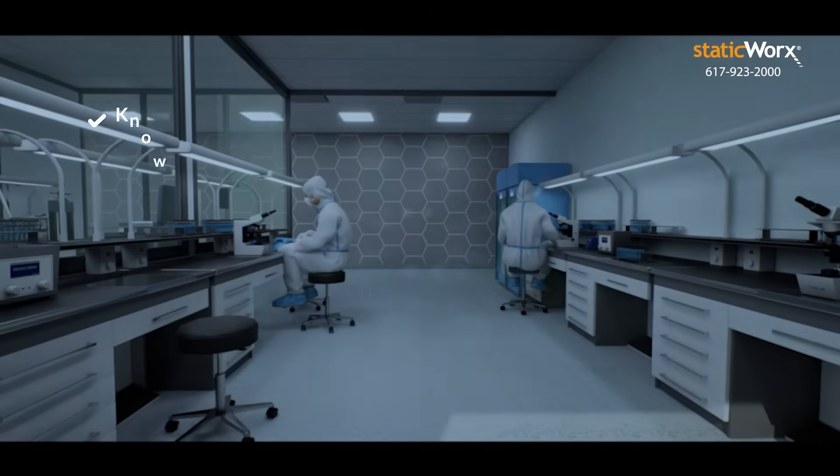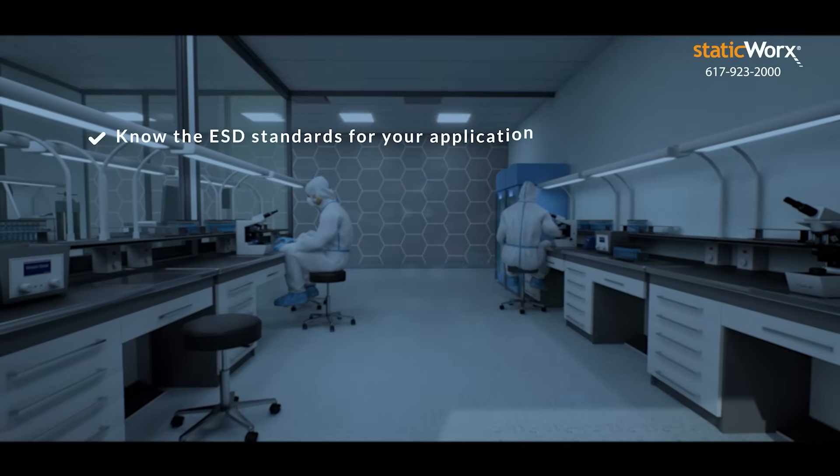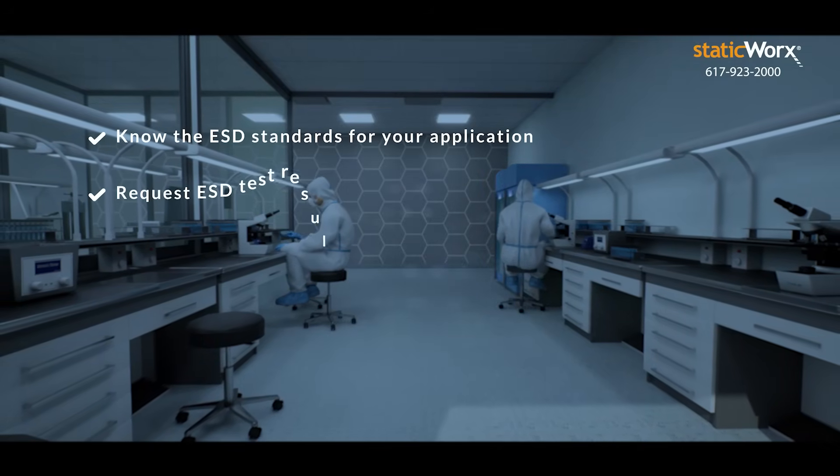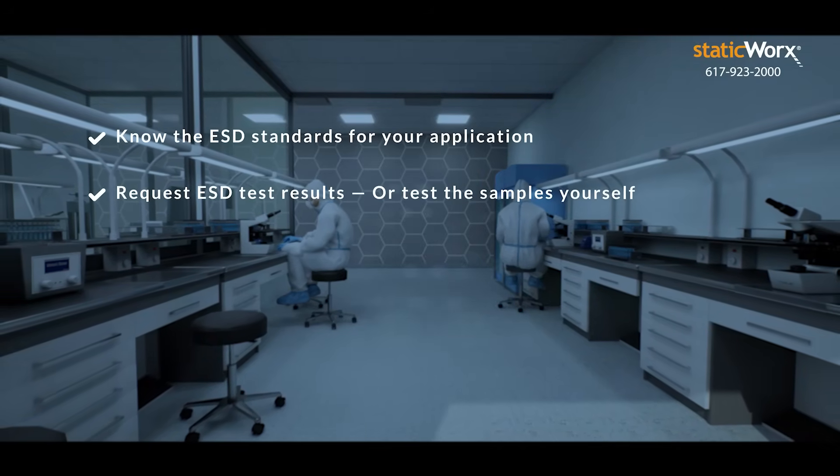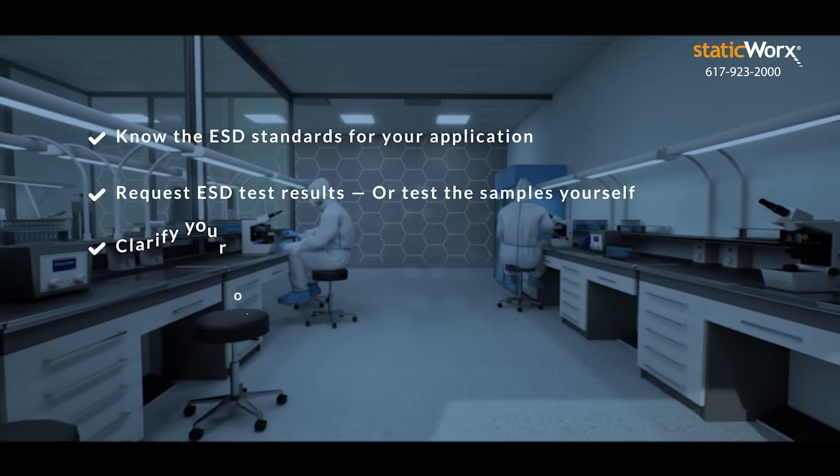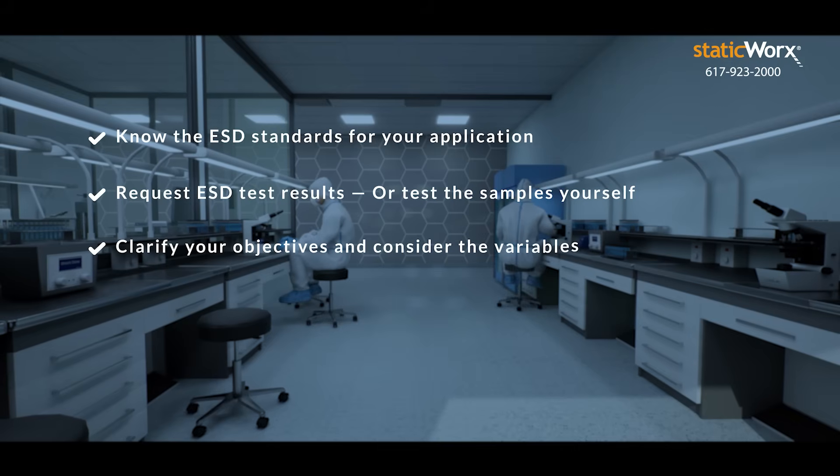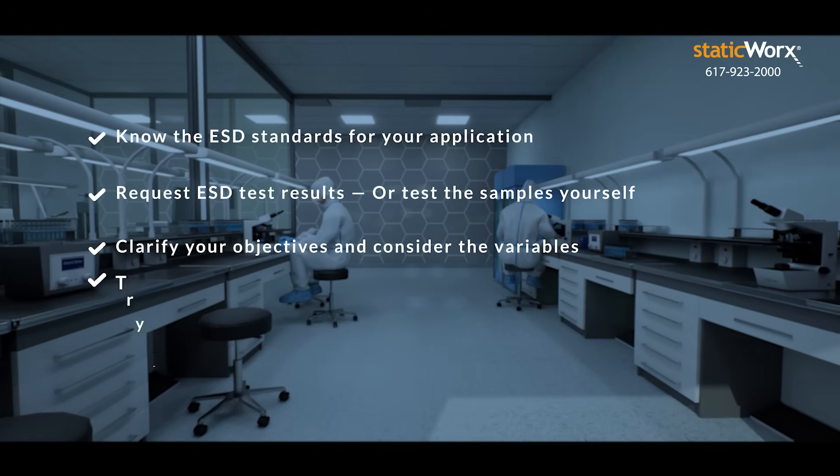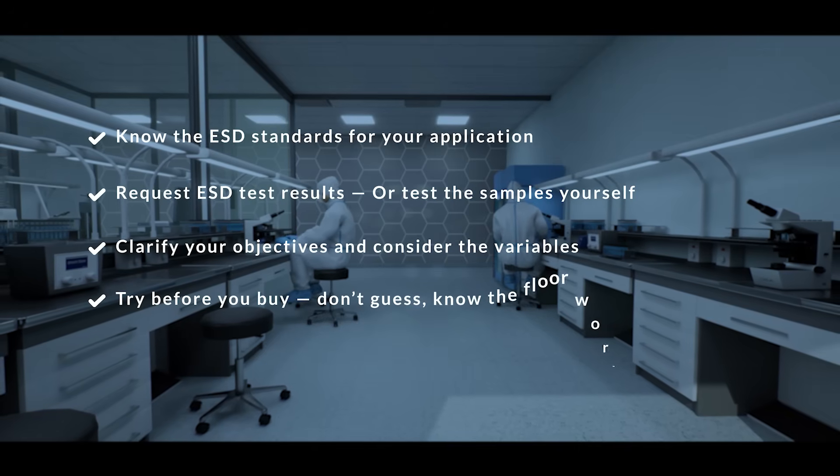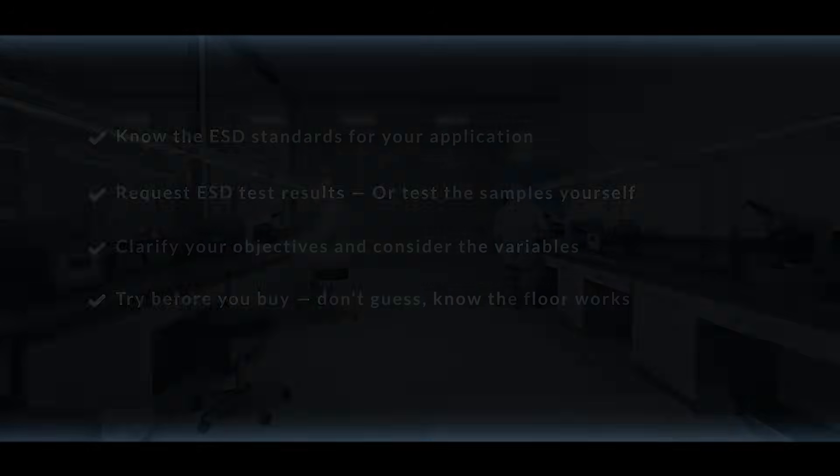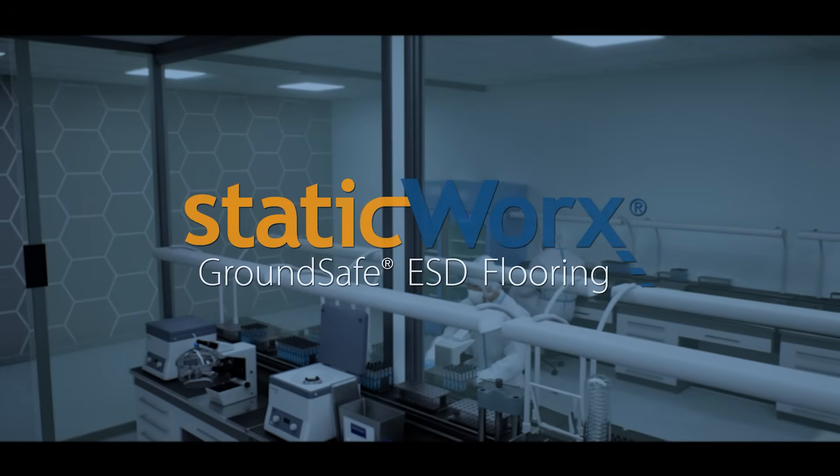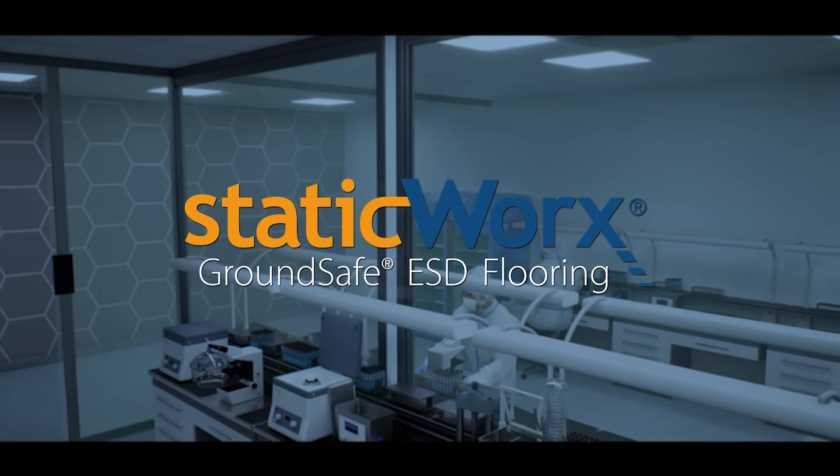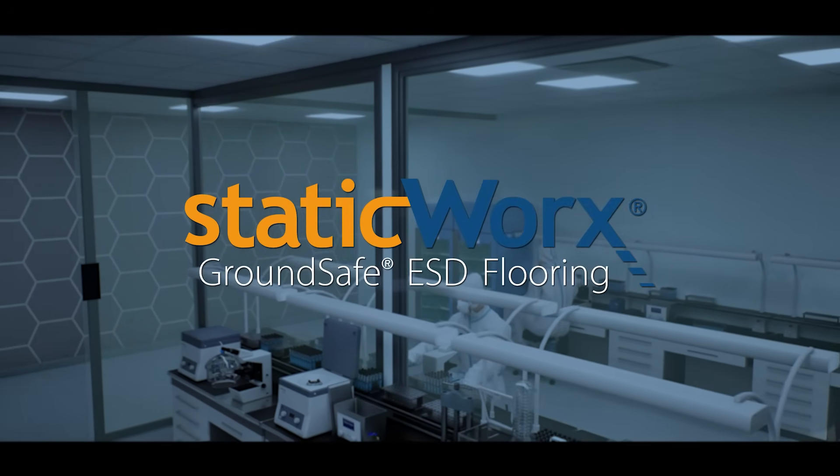Let's recap. Know the ESD standards for your application. Request ESD test results or test the samples yourself. Clarify your objectives and consider the variables. Try before you buy. Don't guess. Know the floor works. Four steps, one rock-solid floor. Protect your mission from the ground up.